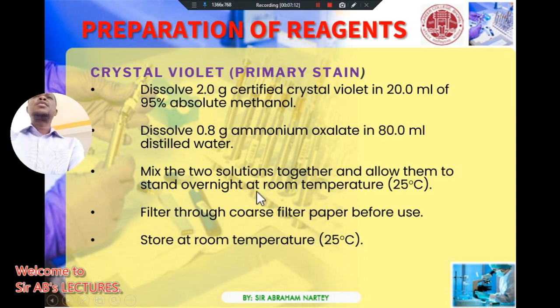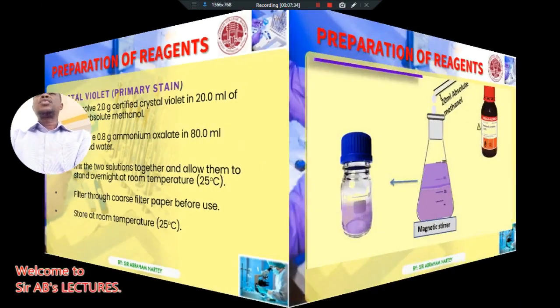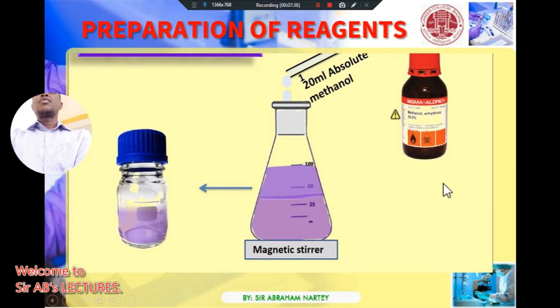So at the end, when you pass through all these processes, it means that you have been able to prepare your dye. And for now, you can confidently say that as a lab technician, you have been able to do what? Prepare your dye, which is what? Identify the primary dye. So that is it. After that, you get something like this. So you see the picture.